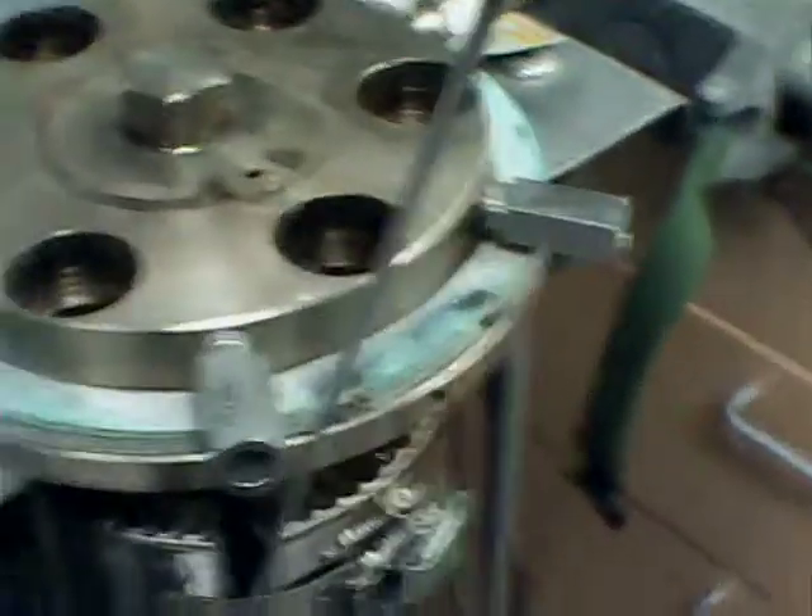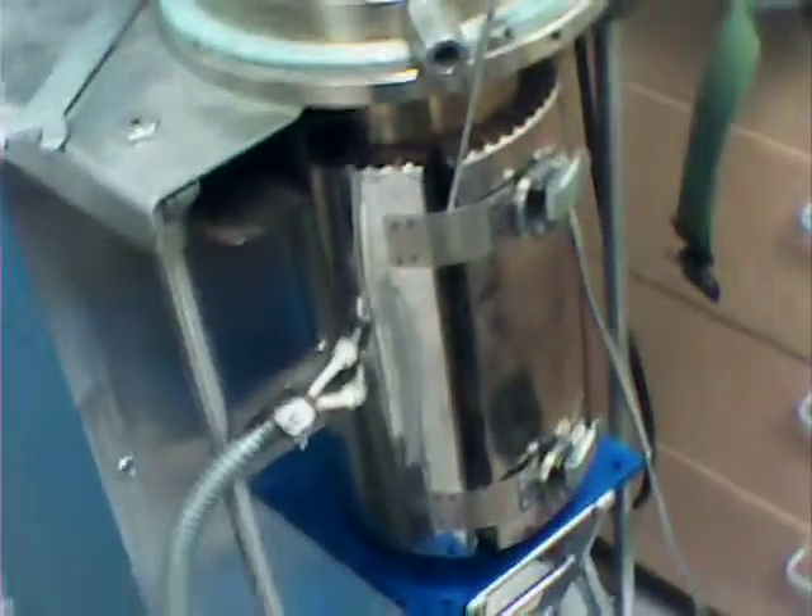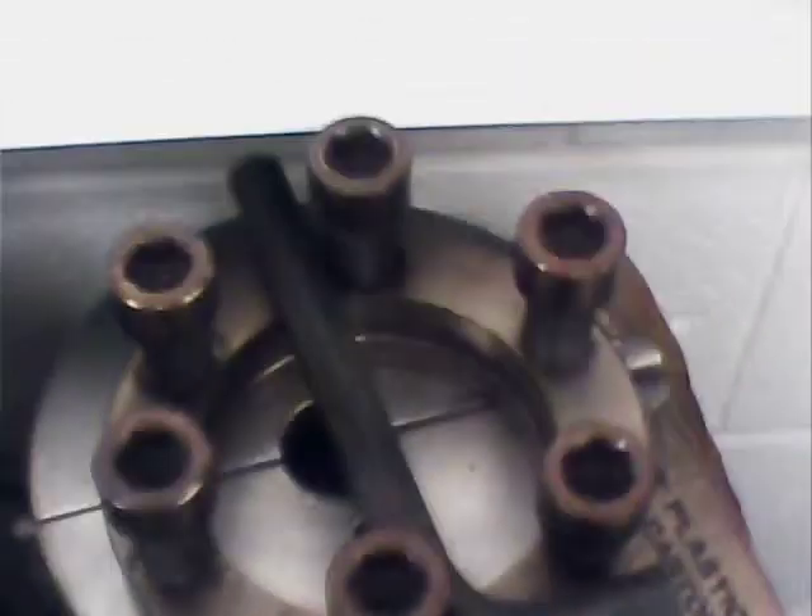We're heating it up right now and we're probably going to try to go to 400 degrees, just to test out the system. Then we close it up and put it under pressure — we'll probably go up to 40 atmospheres, that'd be about 600 psi gauge. We'll check all of our system and make sure everything's sealed.